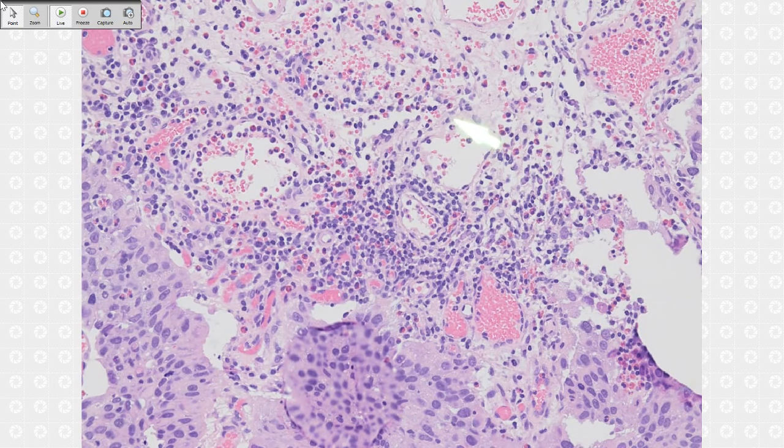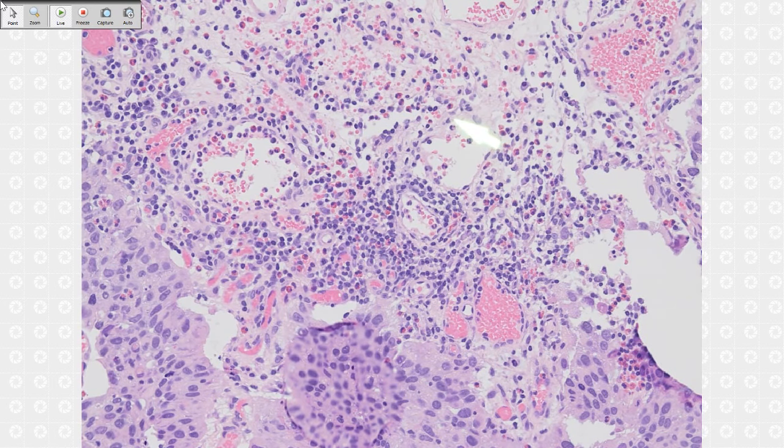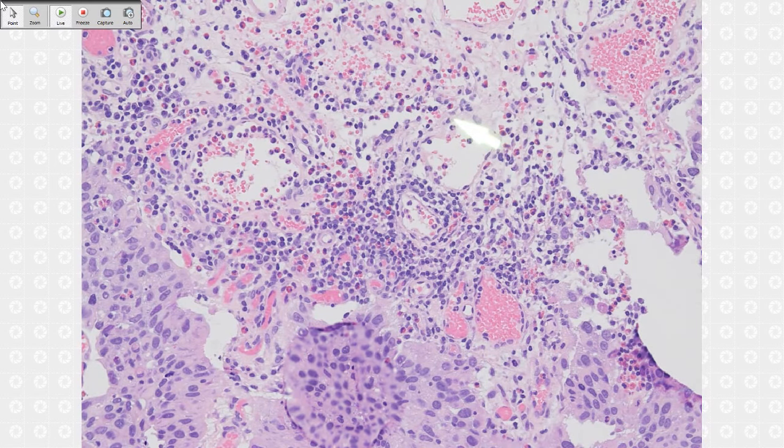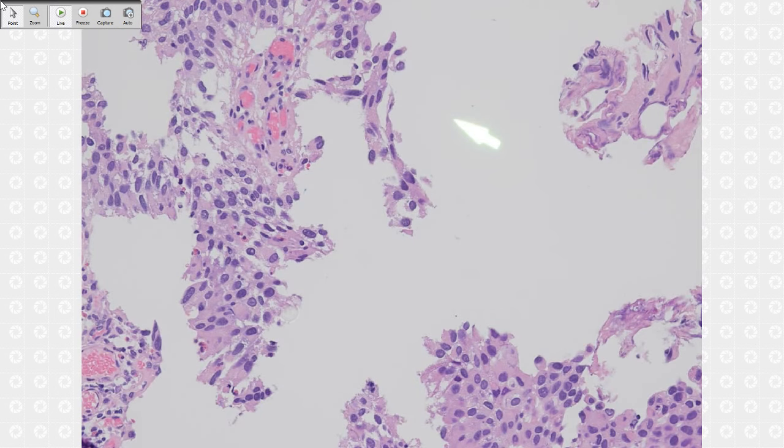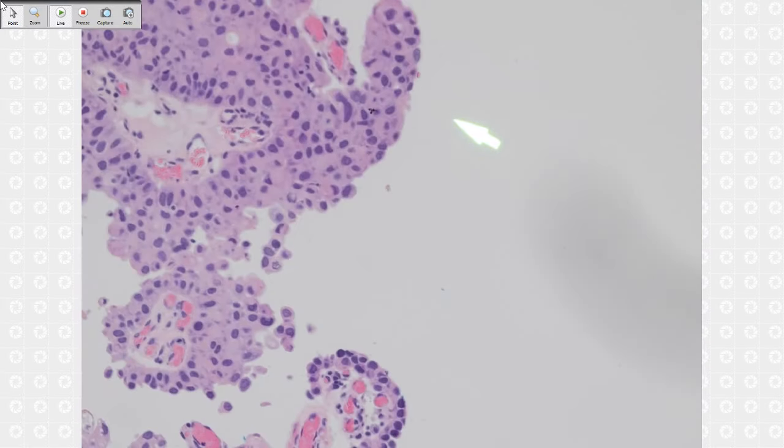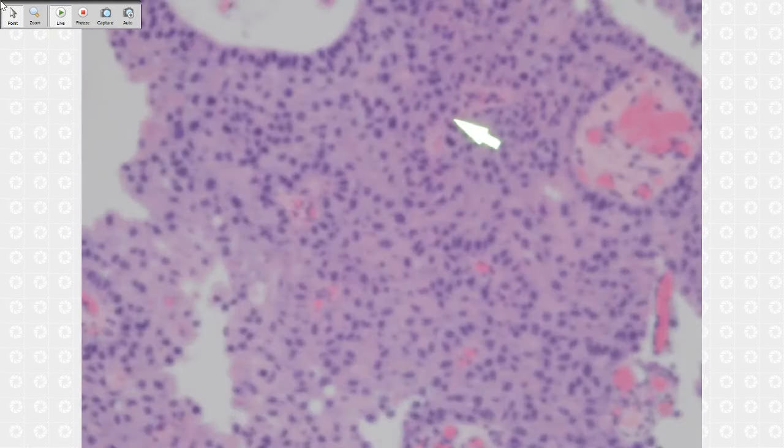Why is it so dark? I don't know why. The condenser is already on. So you see here, this one is different from the... Oh, no. I don't know how to get more light. It's already at maximum. It's better. Okay, not really. No. Okay.